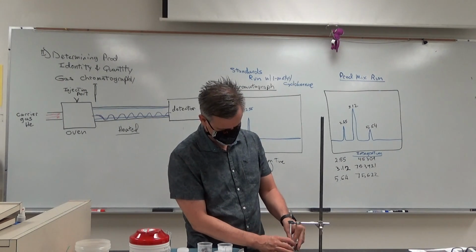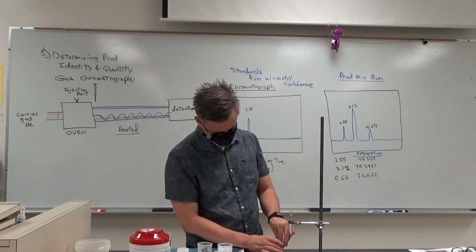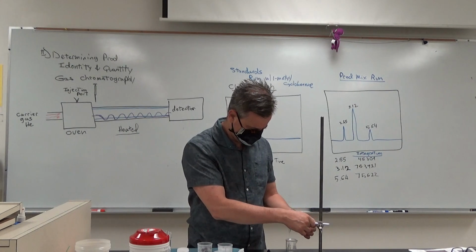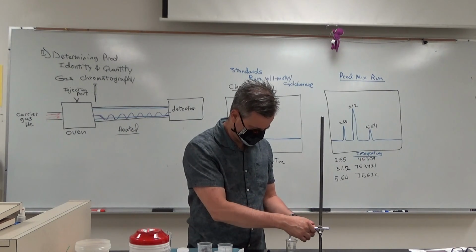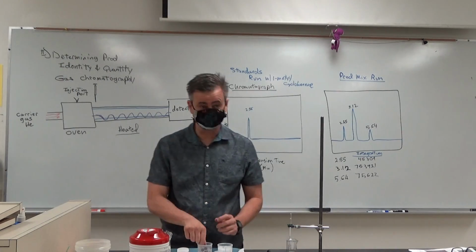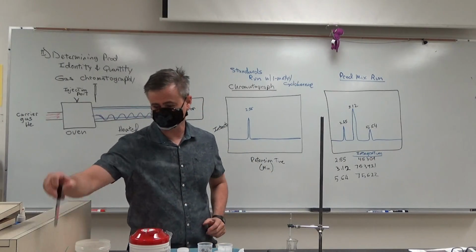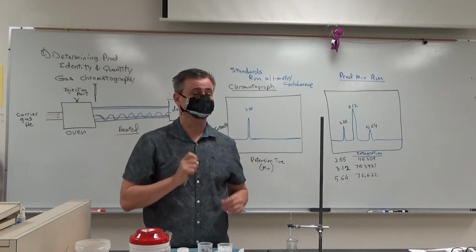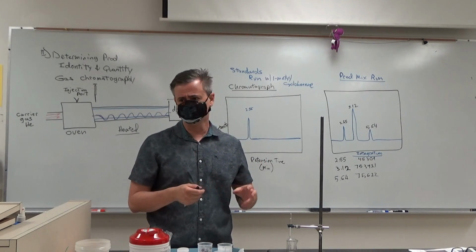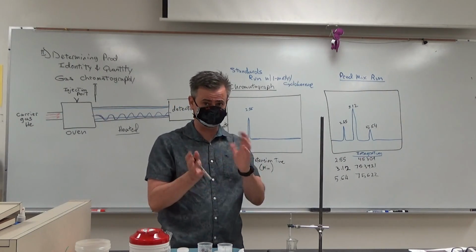Yeah. This beaker is too big. You have a smaller one. But in any case, you want a beaker in there so it don't spill as always. On this vial down here, you can't put tape on these little vials. It won't fit into the machine. Okay, so you have to take a Sharpie and write on it. Okay, and you're going to write, I put it in there, it's either 2-hex or 4-hex, depending on which alcohol you started on.